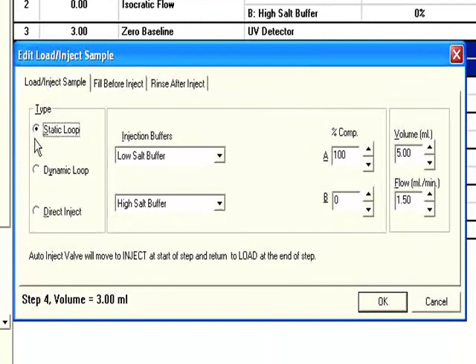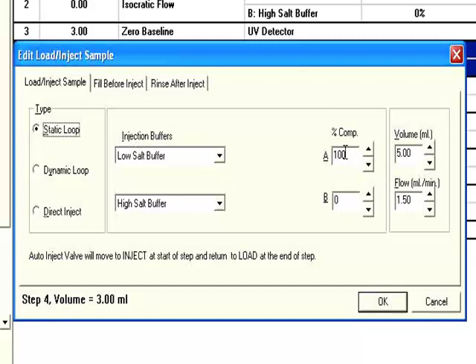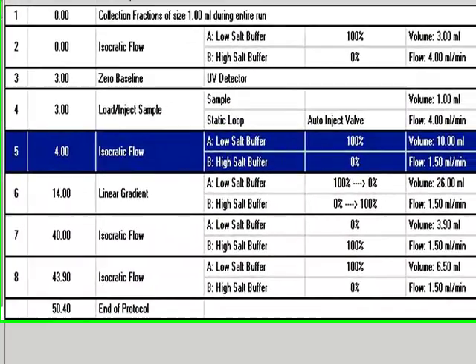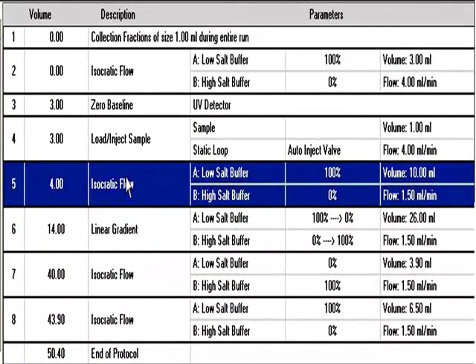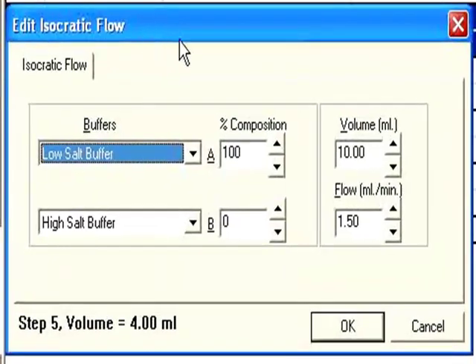So I'm going to use the static loop, although we do have other loop options, the dynamic loop for 25 to 90 mLs injection, or direct inject, which would be from the pump. So static loop. We're going to run our running buffer through the system. Let's say we're going to run 1 mL of our buffer at a flow rate of, let's say, 4 mLs per minute. Great. So we've injected the sample. Now the sample's on the column.